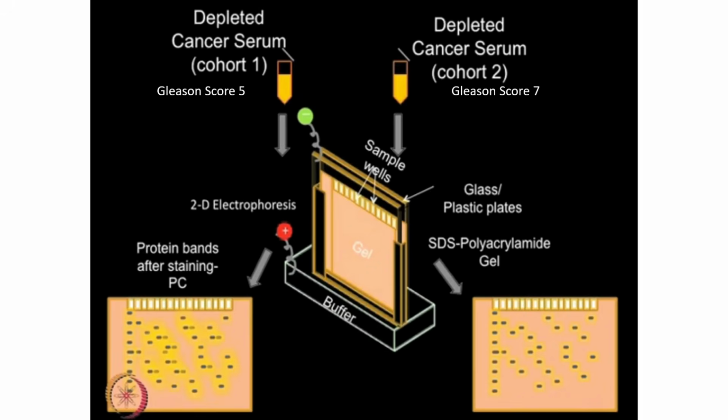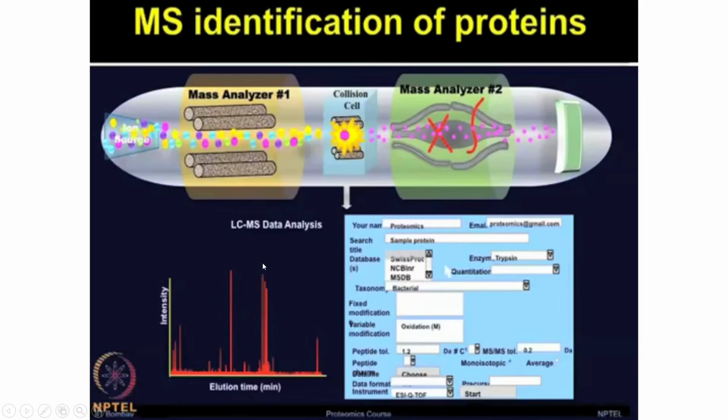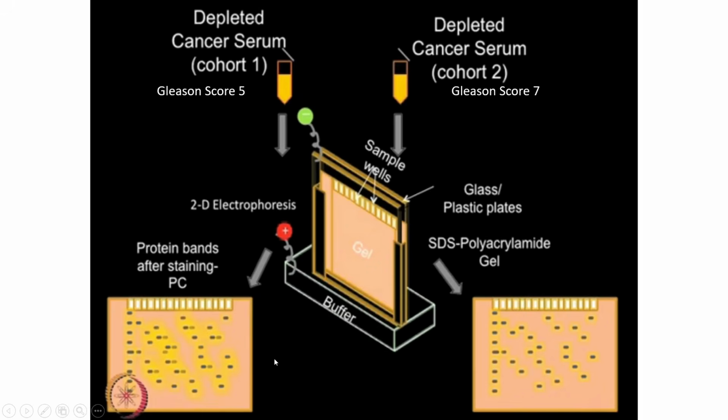and accordingly they had that metadata with them, and they used that data and separated both disease patients. So they had cohort 1 and cohort 2, mixed them together and did the differential gel electrophoresis analysis. After doing the analysis using DeCyder software, they found that, for example, this protein got upregulated or might be seen only in one condition in one cohort but not in another cohort. Some of the proteins got upregulated, downregulated, etc.